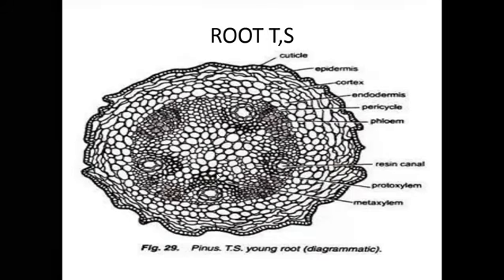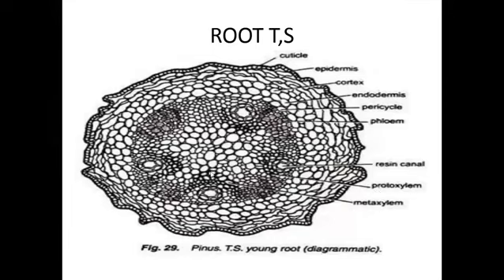Large size xylem cells are called metaxylem, and small size xylem cells are called protoxylem. From each metaxylem cell, two protoxylems are developed, and they are V-shaped in structure. Between these two protoxylems, resin canals are present. Resin canals are a general character of Pinus.